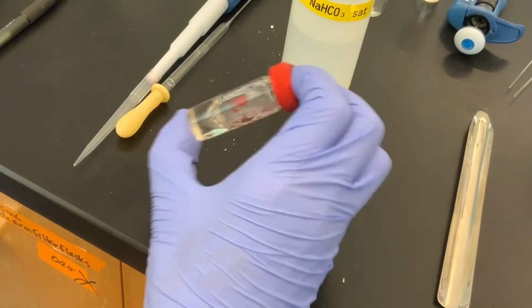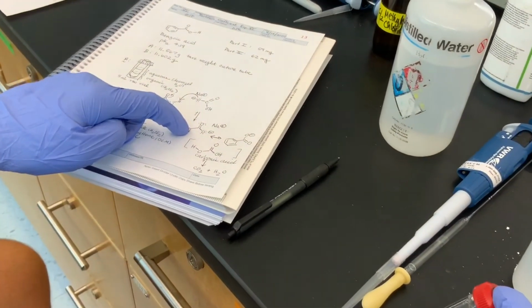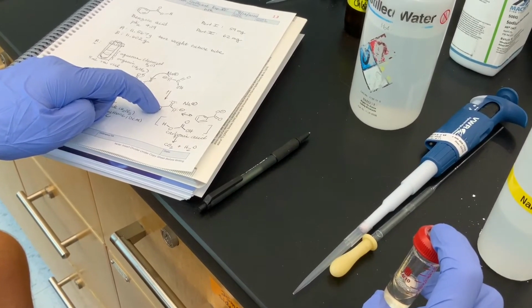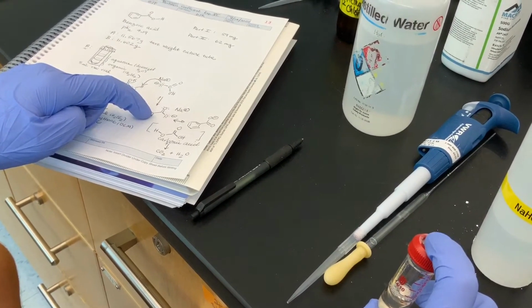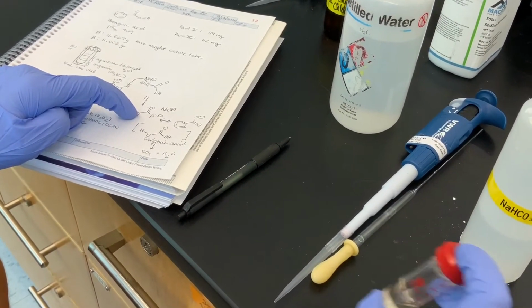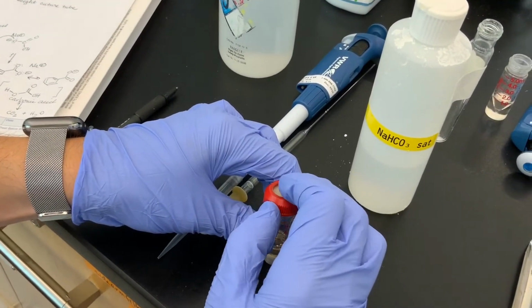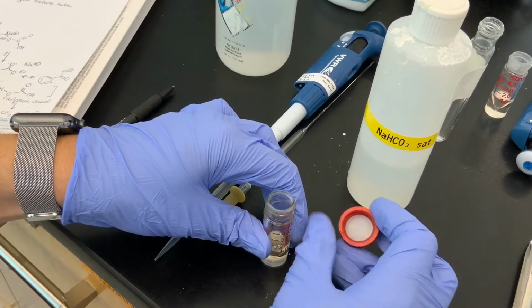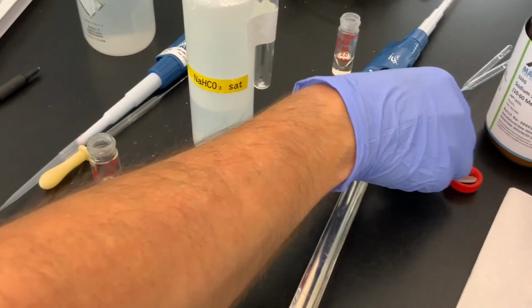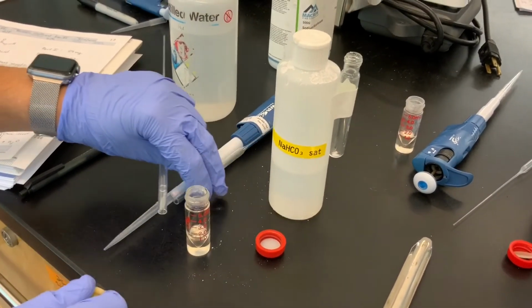And of course, we're now expecting that there's going to be more sodium benzoate dissolved in the aqueous layer, and that ultimately our culture tube B will have less benzoic acid in it because benzoate anion is not very soluble in methylene chloride. It's much more soluble in an aqueous environment. So now I'm going to use another pasteur pipette because I don't want to contaminate.